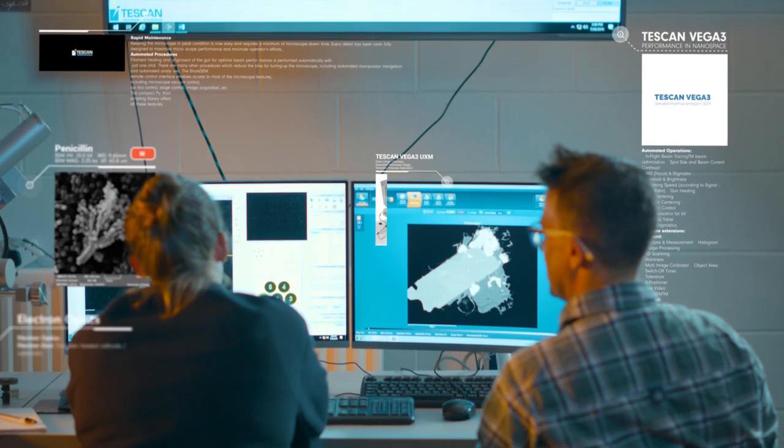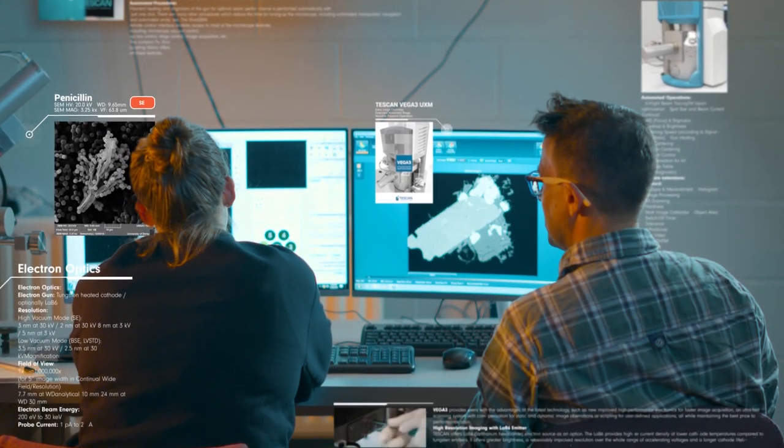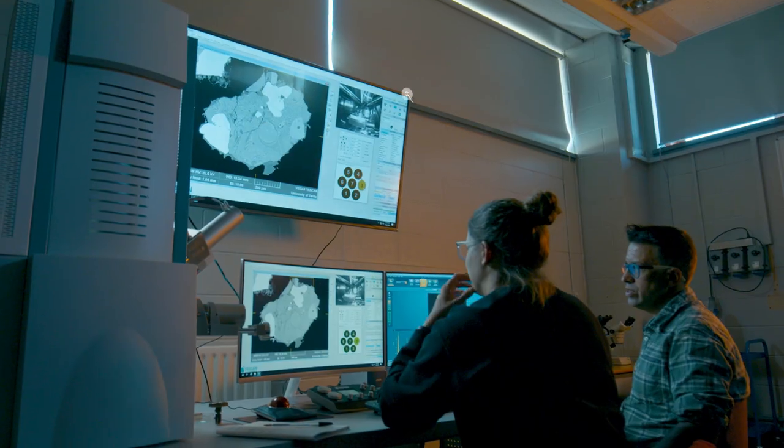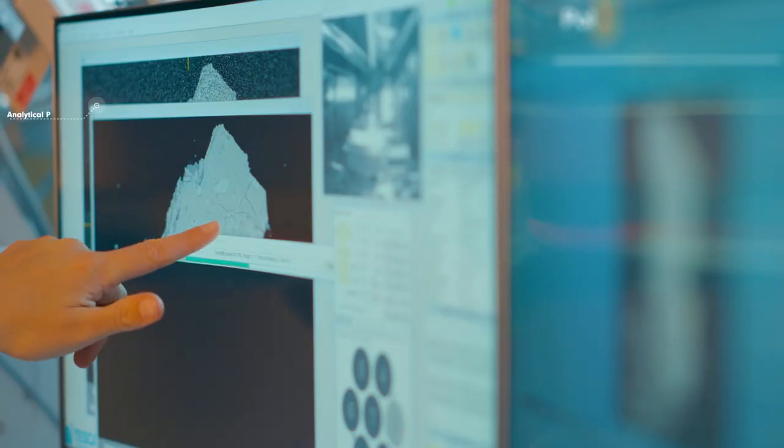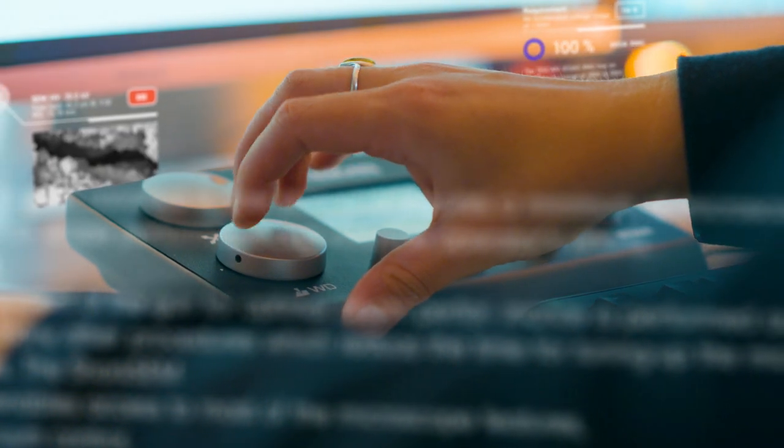We have here a Tescan 3 scanning electron microscope and this is used to magnify specimens from a low magnification up to a very high magnification using a depth of field that enables us to see the whole sample with high resolution.